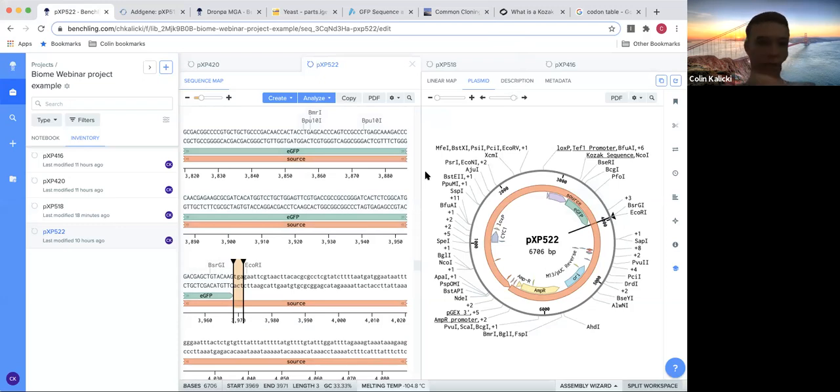How do you choose the right stop codon? Great question. The stop codon is kind of general purpose. So in all that sequence, that TGA is going to just stop it no matter what once you insert it there. If it ever sees that TGA, it'll always stop. So the stop codons are very generic. Same with the start codons, which is super important if you think about the way the machinery of your cell works. Having generic start and stop codons will save you a lot of time and energy rather than having specific ones for every protein. So you can always use that TGA, and that TGA sequence is always going to be a stop codon. Great question.